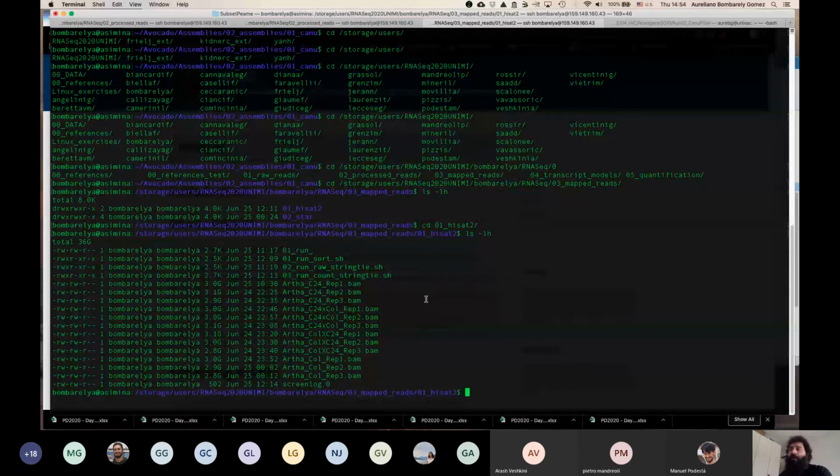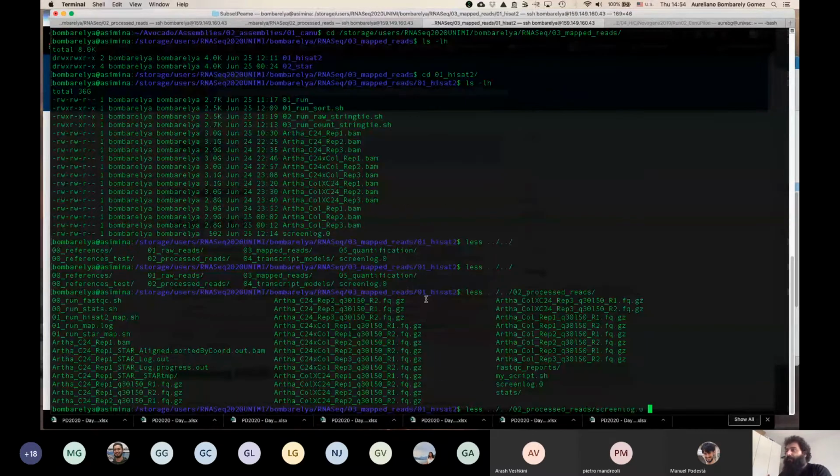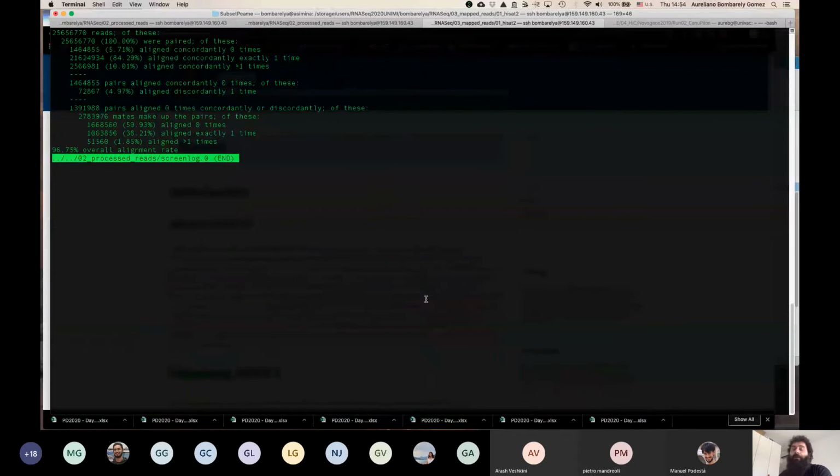And the first that I want, so I made the mistake here that I didn't have the summary. Okay, so my summary is on my screen. So let's go to the screen. I don't think that I deleted it. If I deleted it, okay, I will need to wait. Yeah, so that will be one of these examples. This will be the classical output, as I mentioned before, of HiSat. Now it's telling you, okay, this is the overall alignment rate. Nothing else, but that will be kind of one of the summaries.